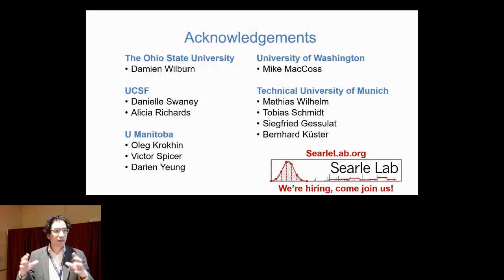Again, our goal was to make the simplest network possible, rather than a very complicated network with lots of different types of inputs and manipulations. We're not smarter than the machine in this case. The machine is better at figuring out different characteristics of these things. So there are only really about 6 tunable parameters in our model, in terms of the parameters that are available to tune.